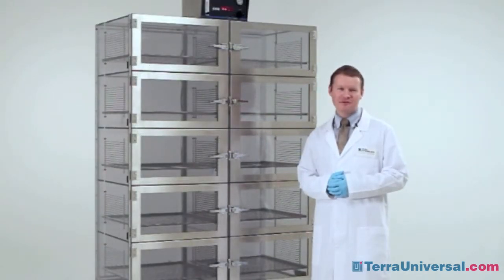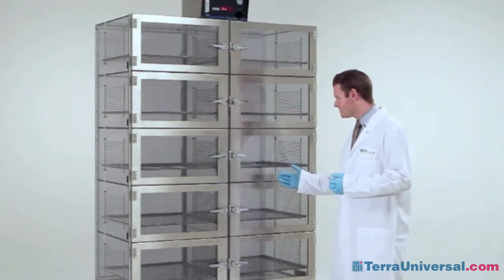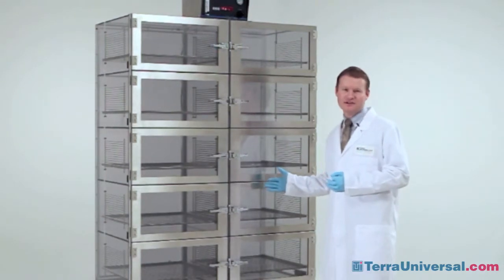One of the components that often breaks down on desiccators are the doors. Terra Universal prevents that by installing stainless steel door frames on each of our desiccator units.